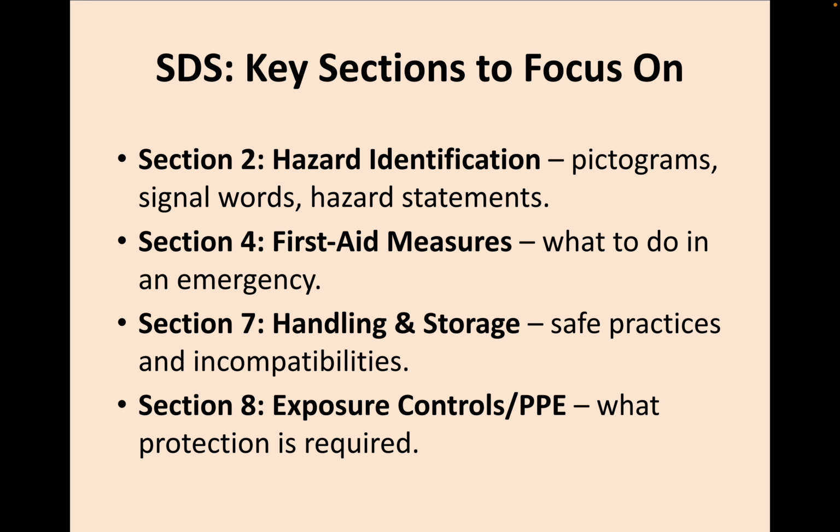Section 2 tells you about the hazards. Look for pictograms and signal words. Section 4 covers first aid, what to do in an emergency. Section 7 talks about proper handling and storage. And Section 8 highlights what PPE is required.